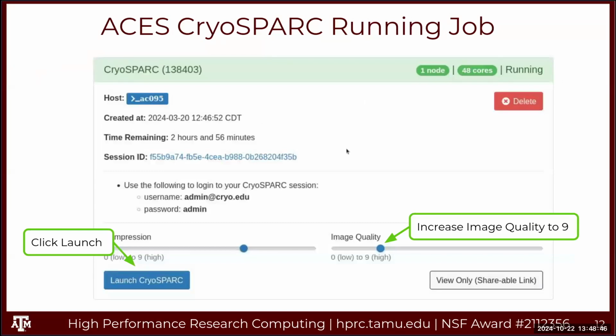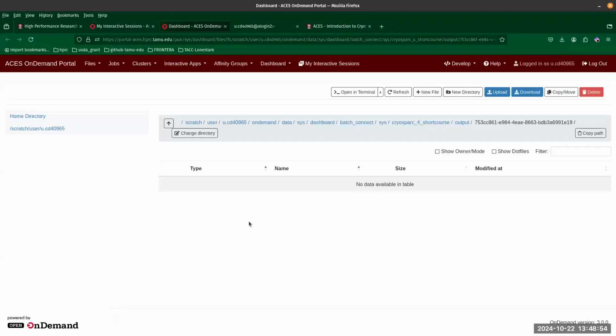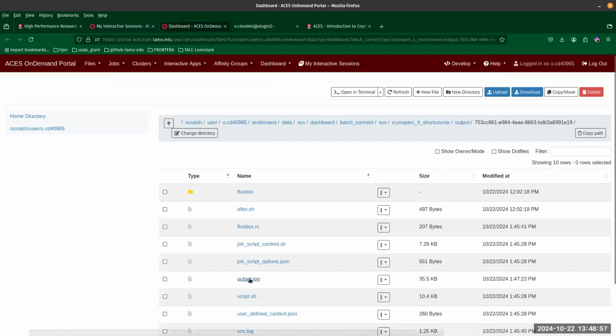All right, so let's go ahead and go back to our CryoSPARC session. Oh, what happened here? Let me see.